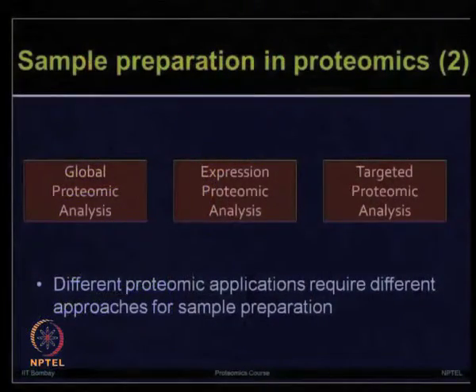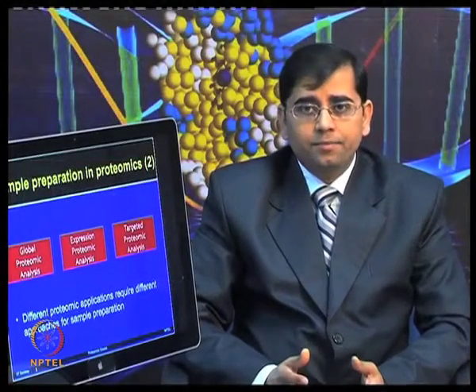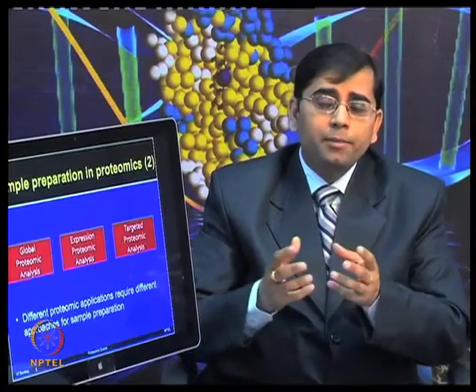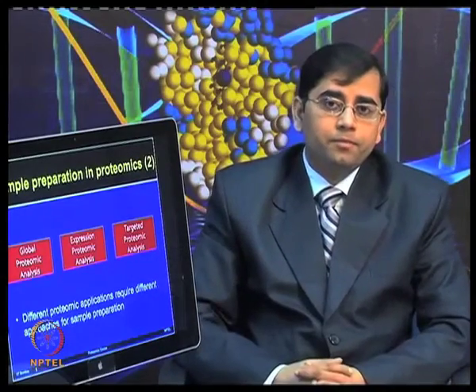So, let me give you 3 different terminologies here for proteomic analysis. One is global proteome analysis, expression proteome analysis, and targeted proteome analysis. When I am talking about global proteome analysis, it means your aim is to characterize all the proteins present in the given sample.